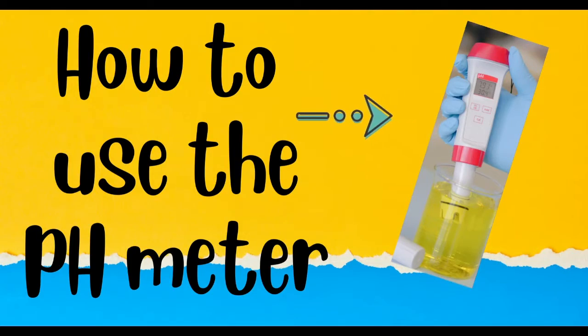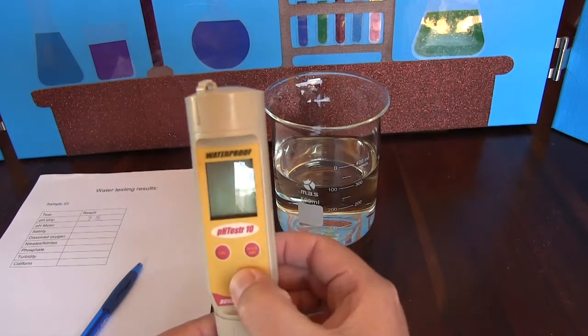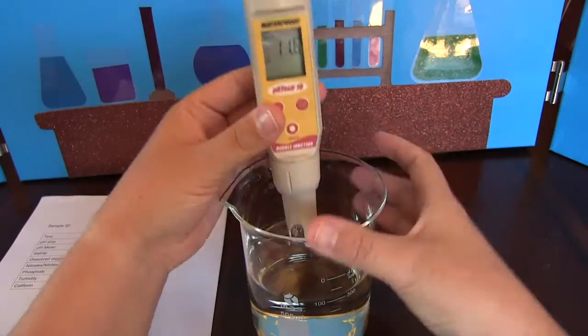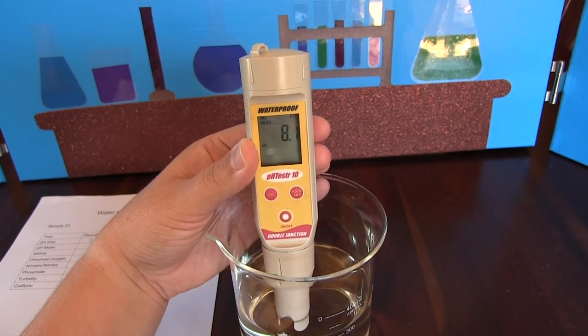Now we're going to use the pH meter. We will need our water sample and the pH meter again. Find the button on the front and turn the pH meter on. We then uncap it and place it in the water sample. Gently stir it around in the water a couple of times.